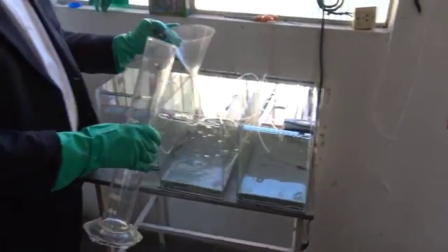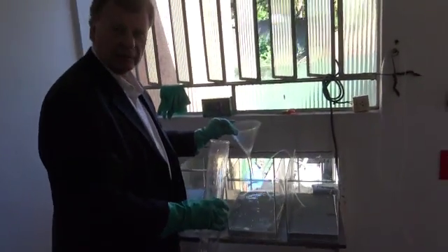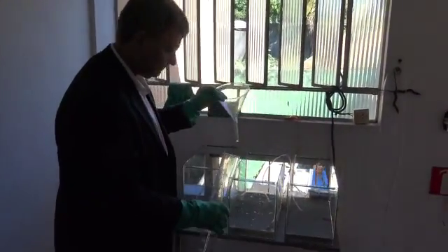So we have 2,000 milliliters of contaminated water from RIO Bay in each aquarium.